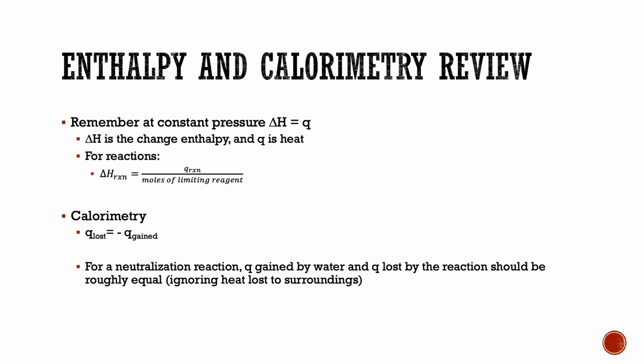Now, for the reactions that we're doing this week, you're going to be doing neutralization reactions, which are typically very exothermic, right? And if it's an exothermic reaction, the reaction itself loses the heat. So our reaction's giving off the heat, and there should be a negative Q for our Q reaction. And then that means the water is gaining the heat, which is going to be a very positive Q instead.